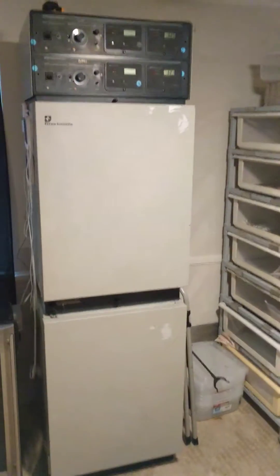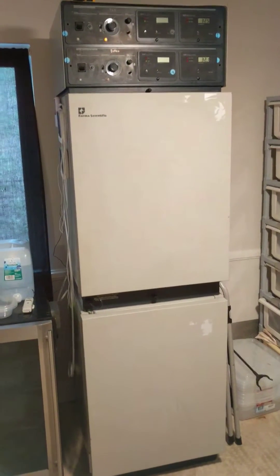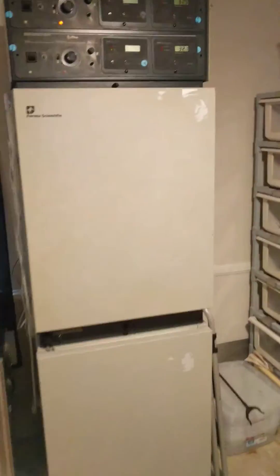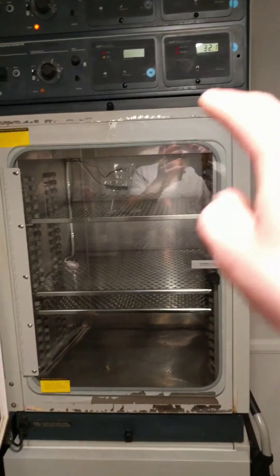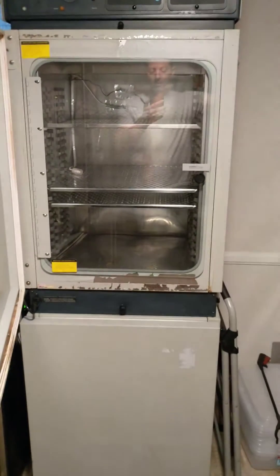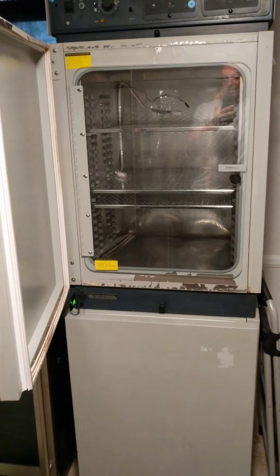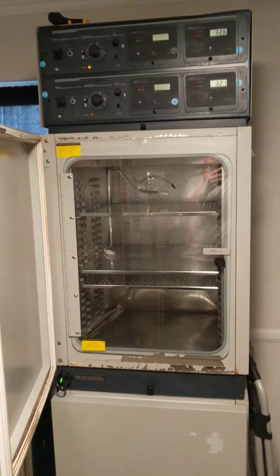They actually use these things to incubate cultures in labs. It's a water-jacketed incubator, so what's really cool about it is the outside of all of these stainless steel chambers — there's a second chamber on the bottom as well — is filled with distilled water that has a rust inhibitor inside of it, so none of that water comes into contact with the inside of the incubator.